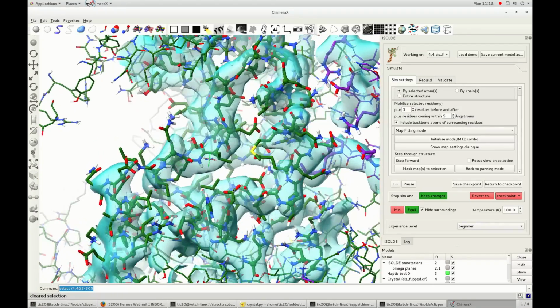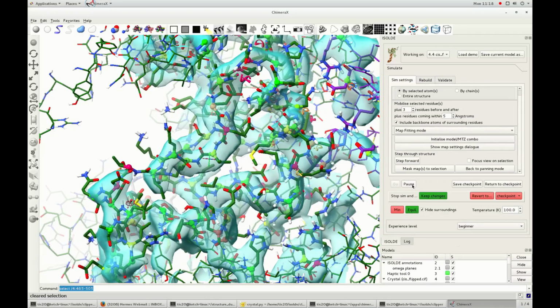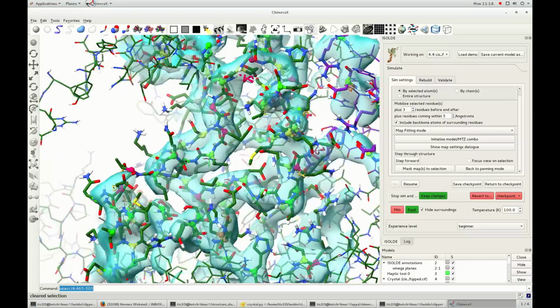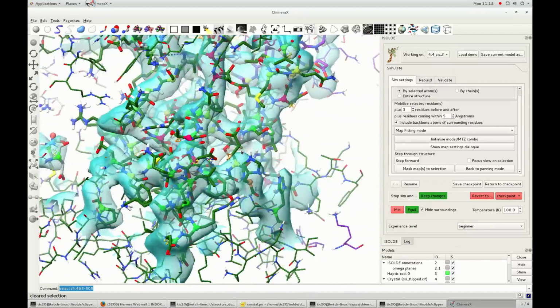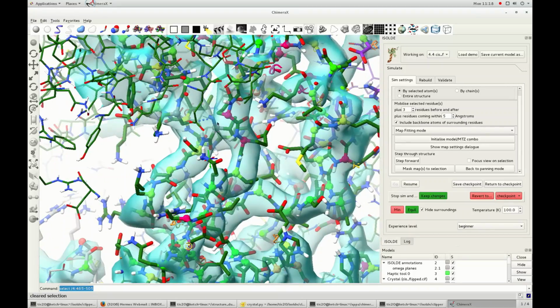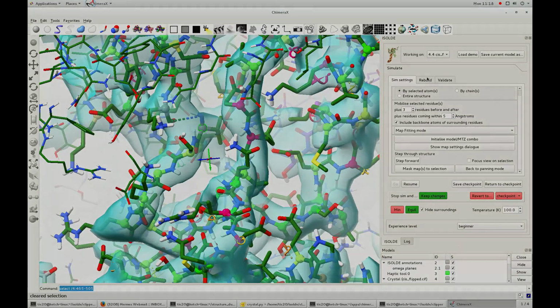Selecting one atom from the helix and each of its flanking loops, then pressing up twice, will give you a simulation-ready selection. To induce the register shift, we start by selecting an atom from valine 469, then using the tools in the register shift dialog to expand the selection towards the C-terminus until it reaches our hypothesized end.